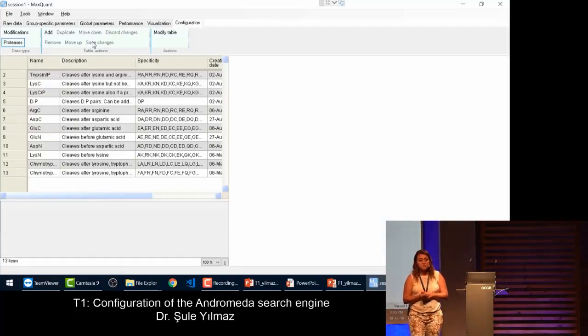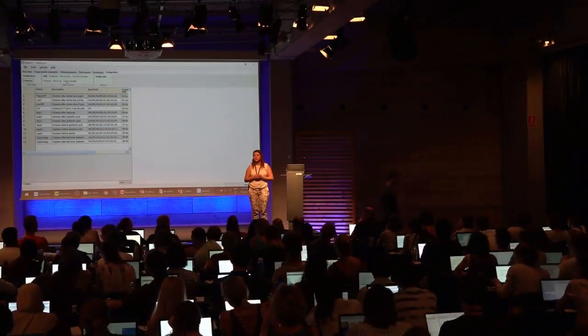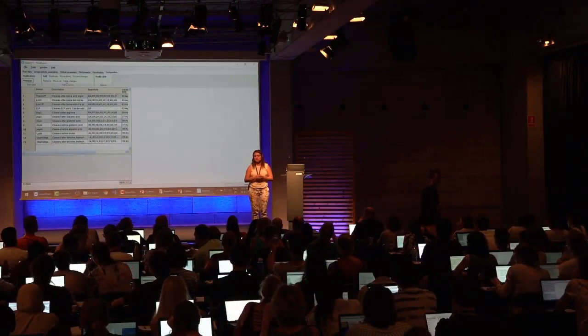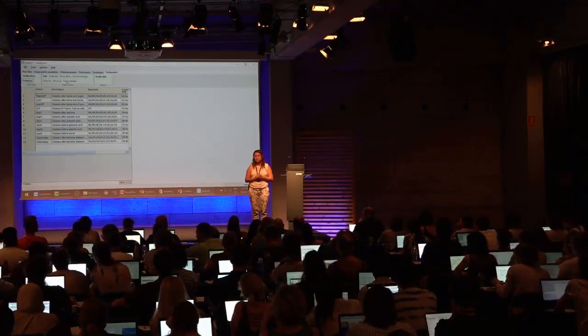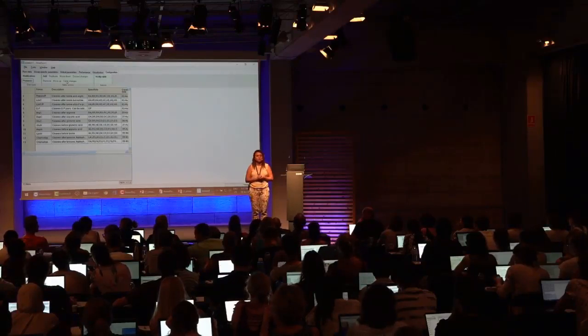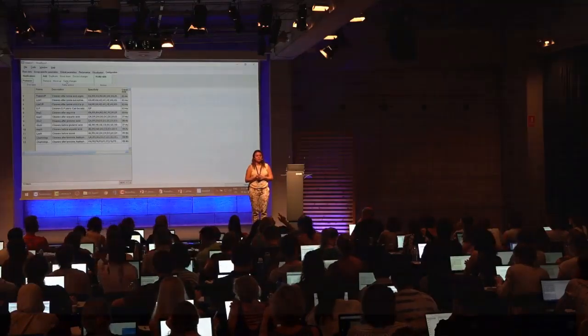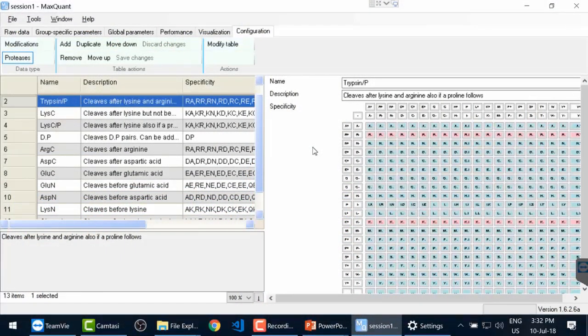Yes? Is there any database where you can find the specificity for any new protease enzymes? As far as I know, I don't know any. Maybe the Proteomics Standards Initiative, maybe they have a list over there, but I didn't check, I'm not sure. Can you repeat the questions when he doesn't have a microphone? So if you know in advance any database that has a list of enzymes, I don't know, but maybe the PSI group has it, the Proteomics Standards Initiative for the mass spectrometry group, maybe they have. Any more questions? No. Can I ask a general question, actually?